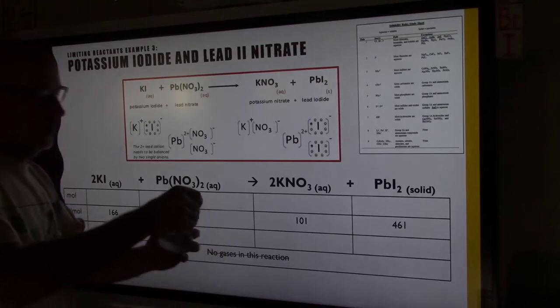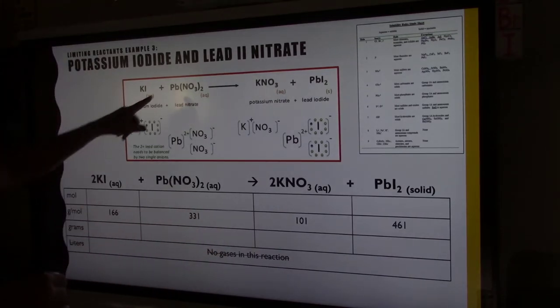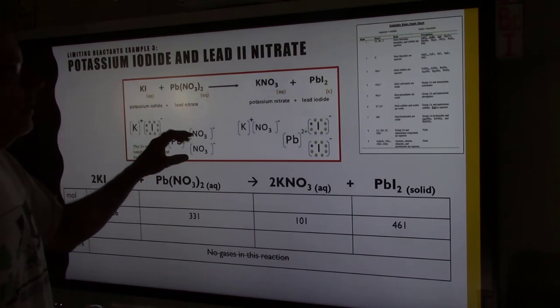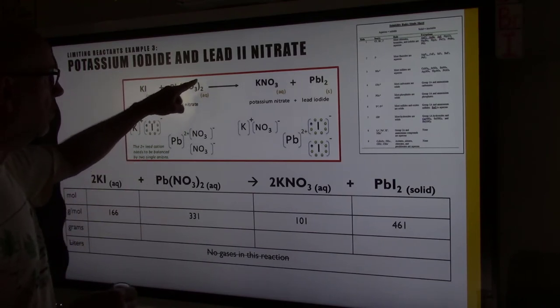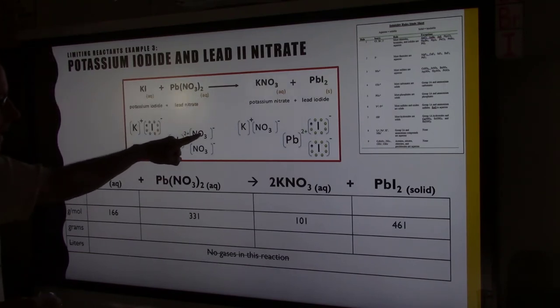I just weighed out 23.86 grams of lead 2 nitrate. Pb gets a +2 charge. We have to say Roman numeral 2 because lead is from the middle of the periodic table. Nitrate, I've got that memorized from my flashcards. It has a -1 charge. +2, -1, crisscross applesauce, Pb(NO3)2: 1 Pb with a 2+ and a nitrate and a nitrate.